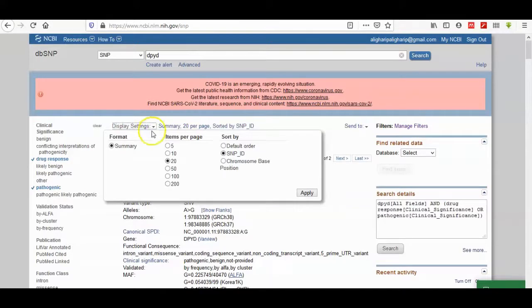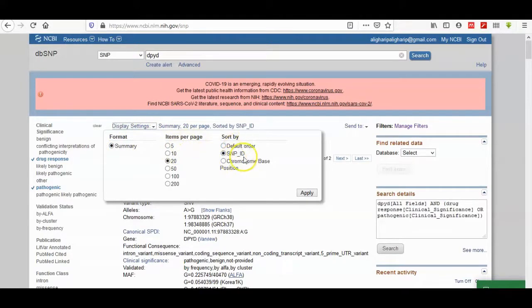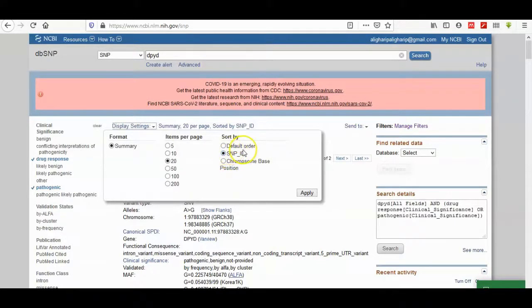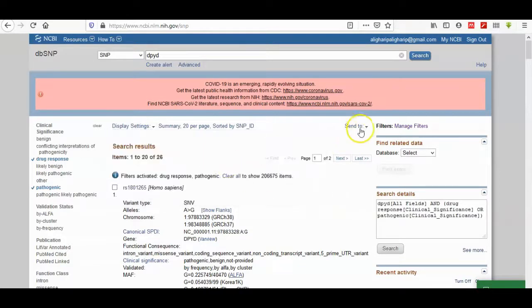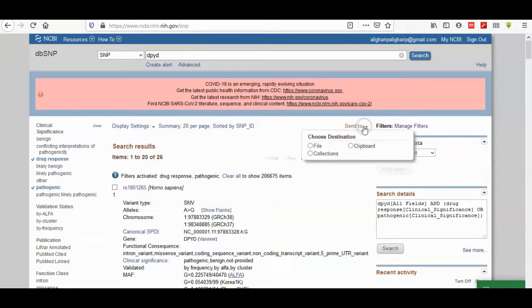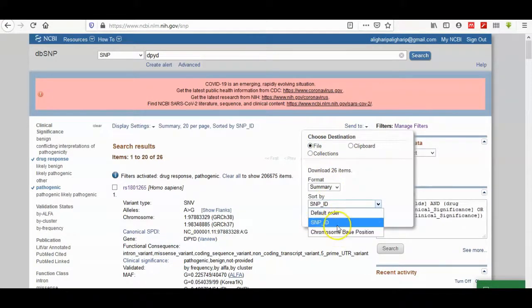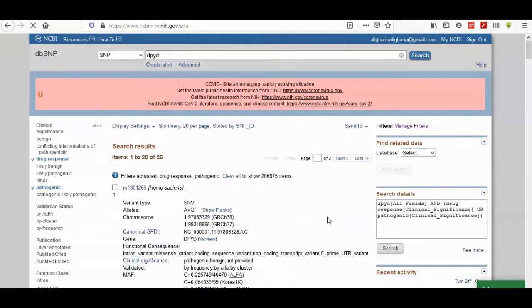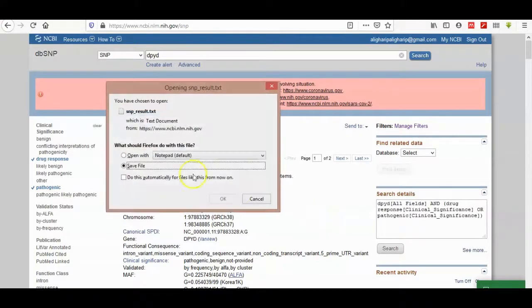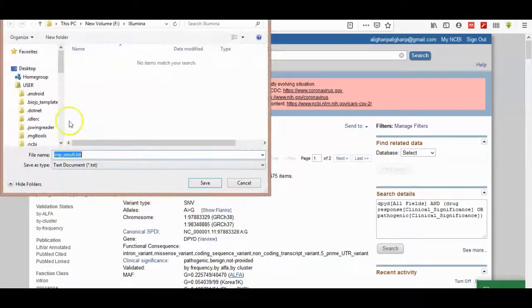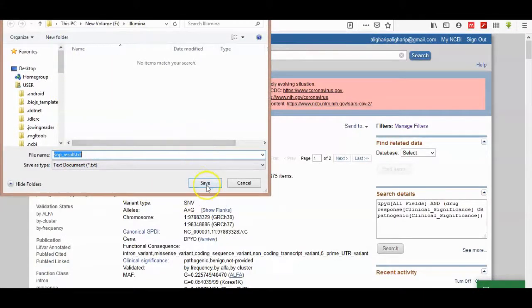You can display settings and summary or item version also by SNP ID, default order, chromosome, base position. Here we can order the SNPs according to its order in the chromosome or default order, SNP ID. Create file. This is a text file containing the SNPs of our interest.